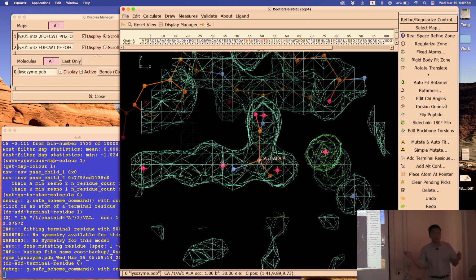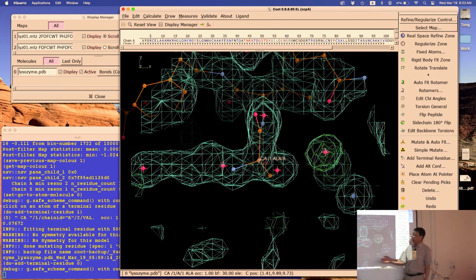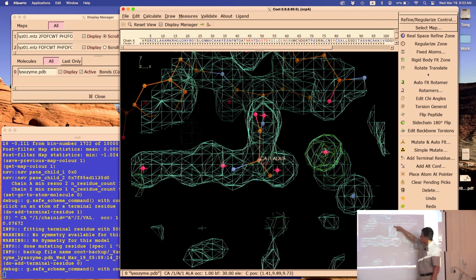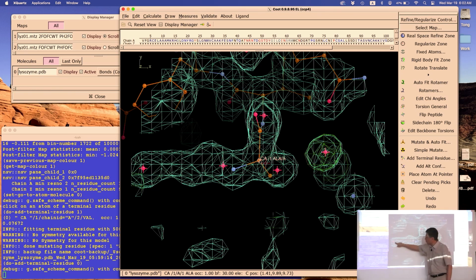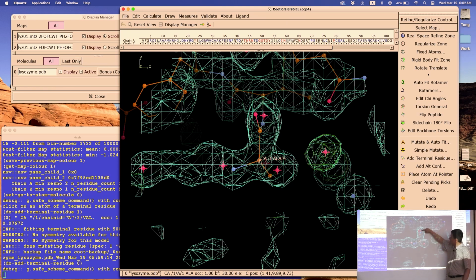Okay, so roughly, we're all together? All right, thank you. So now we have 4 water molecules. So maybe you can rotate things around so that it looks something like mine. So main chain this way, side chain going to the right. If you want to do it that way, that's fine. You can see the 4 waters here, here, here, and here that we need to delete.